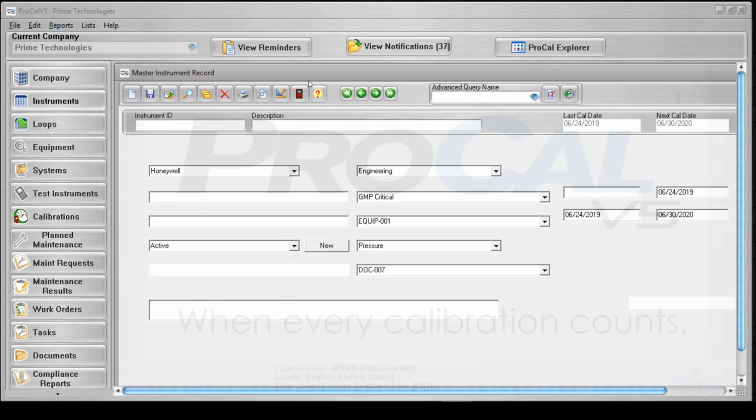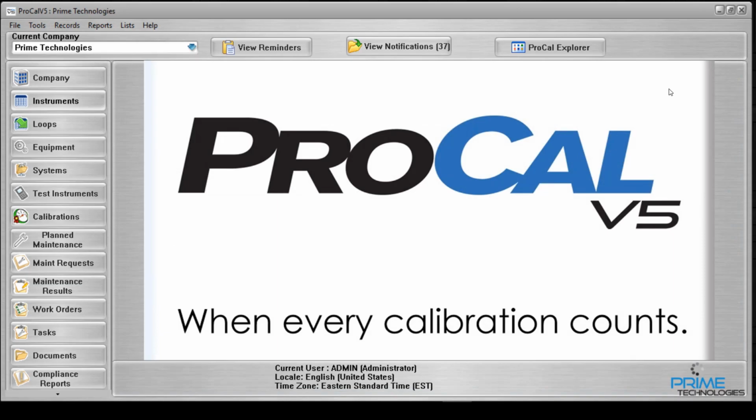And that's all there is to it. Now you know all about master instrument records in ProCal V5.